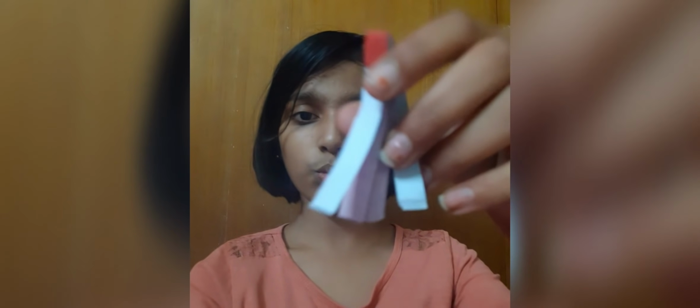Today we will do another science experiment, after a long time, about litmus paper. This litmus paper has two variations. One is red litmus paper, which is like this. Okay, this is red litmus paper, and this is blue litmus paper. So there are two types of variation in litmus paper.